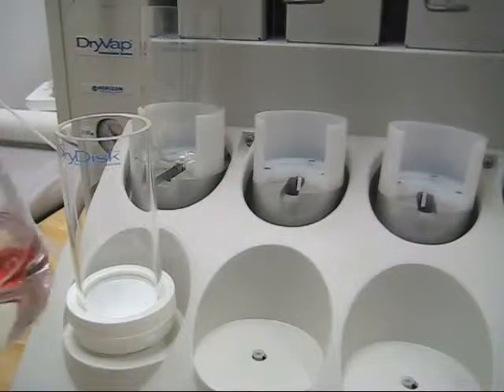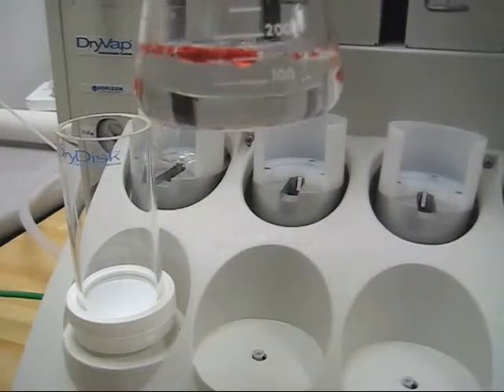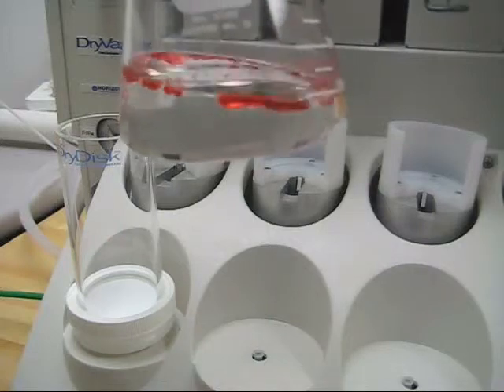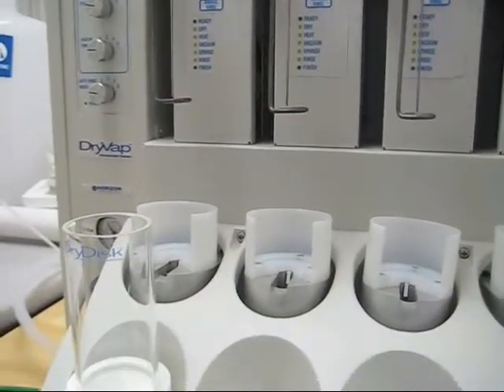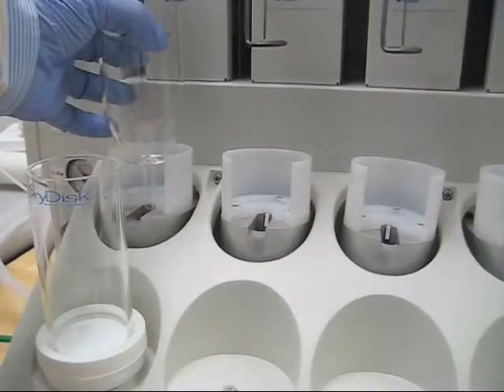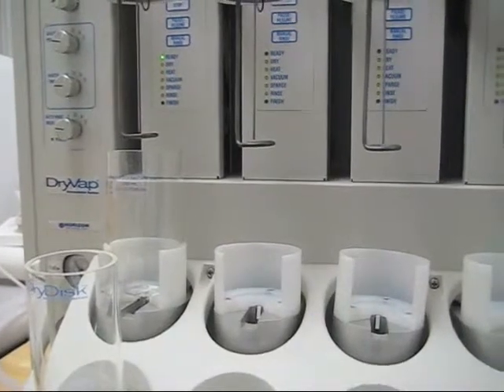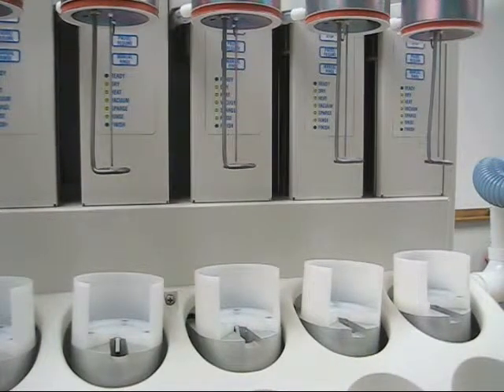Now I'm going to go ahead and run a sample here. This is about 200 mils of methylene chloride with some water in there. I've added some dye to the water just so you can see it as it gets trapped by the dry disk. I'm going to come in here with the concentrator tube and place it under the heater. When I place this down, there's actually a switch inside of the cradle that supports the tube. The ready light is now on for this station — that's a safety feature so you can't turn the heater on without the tube in place.